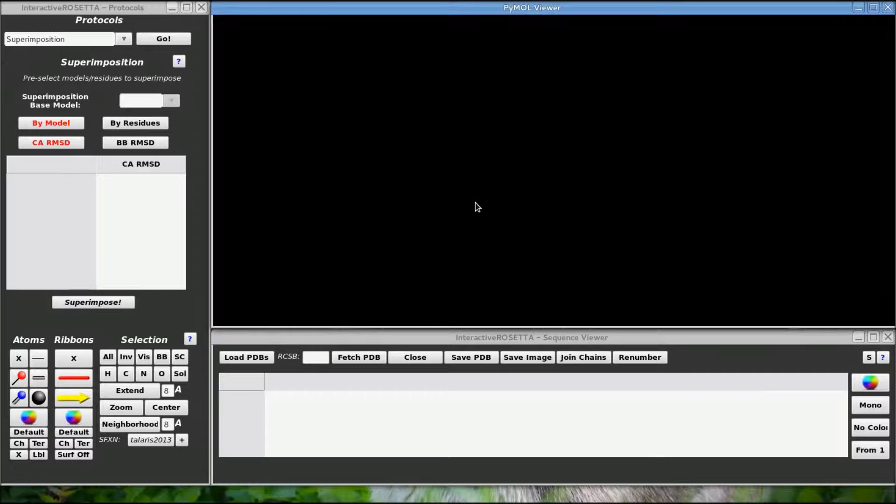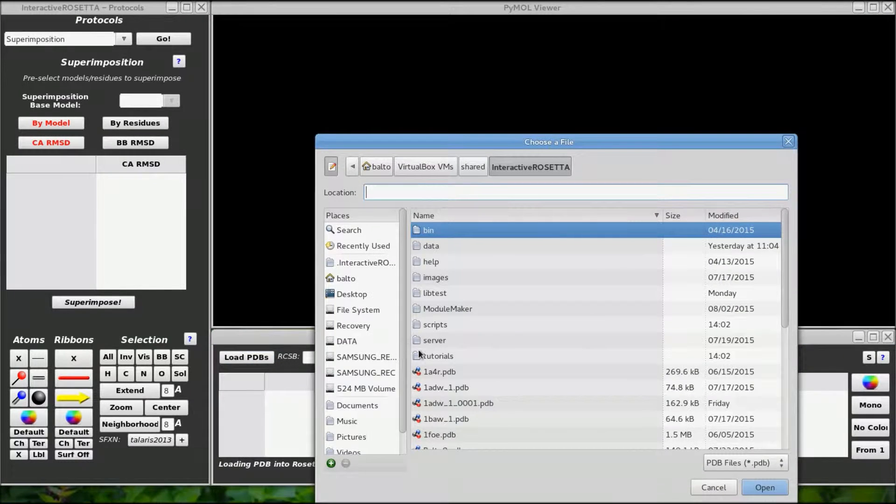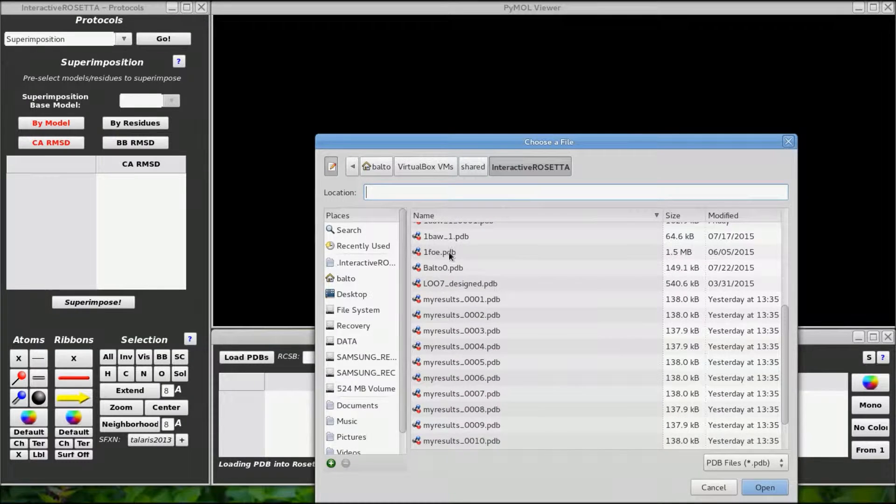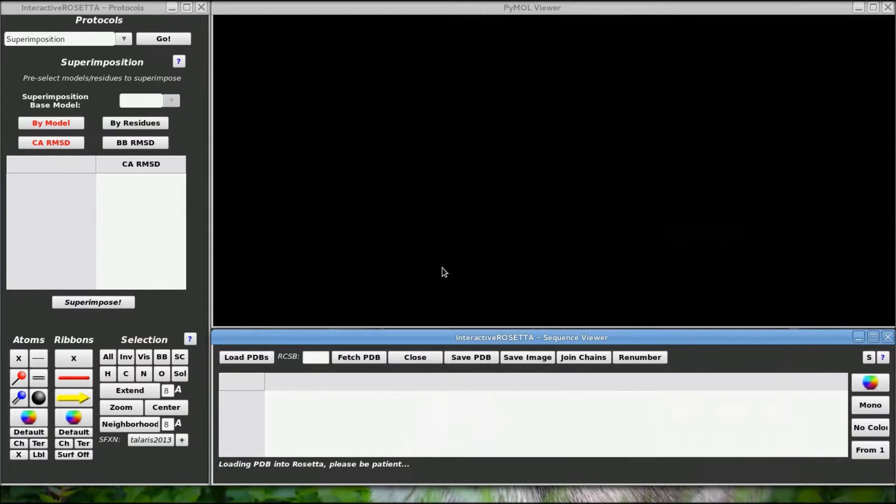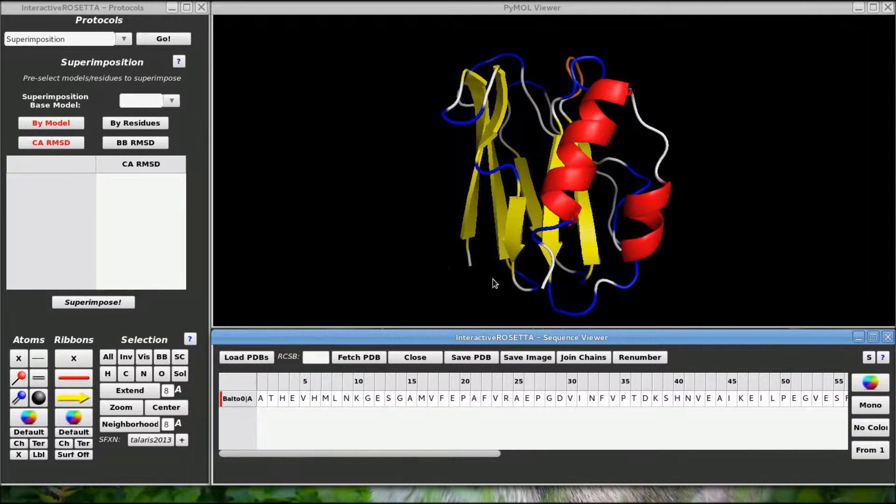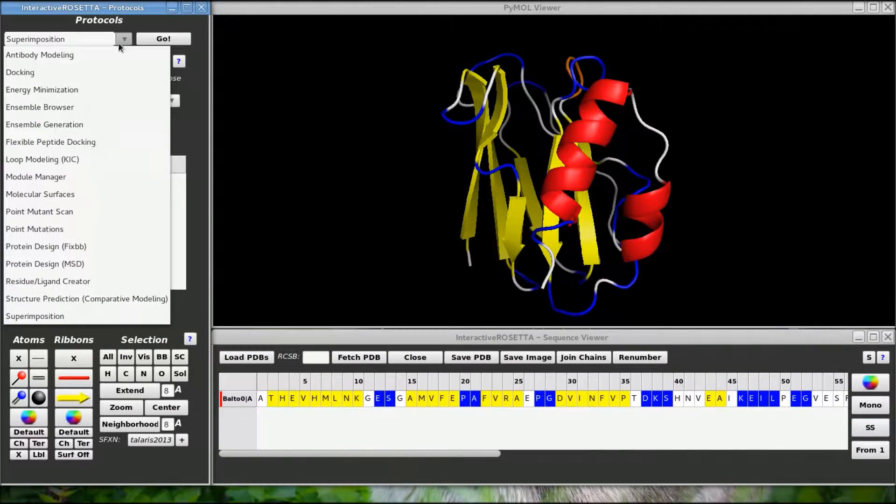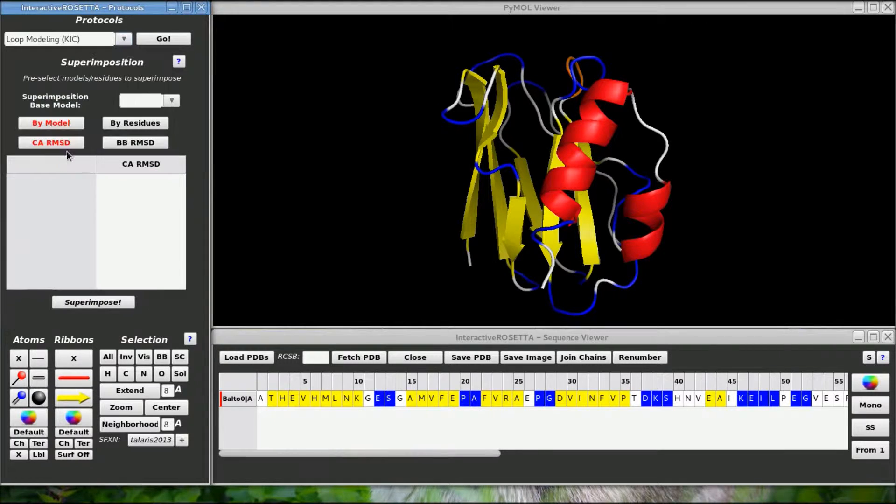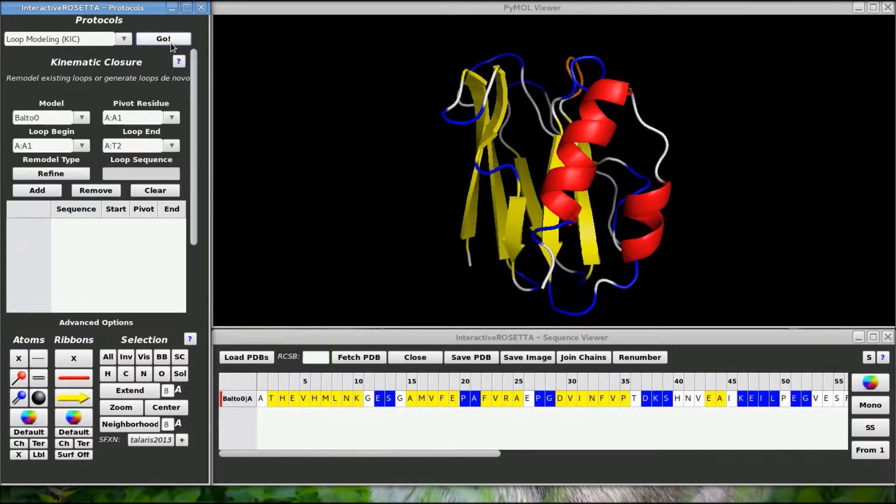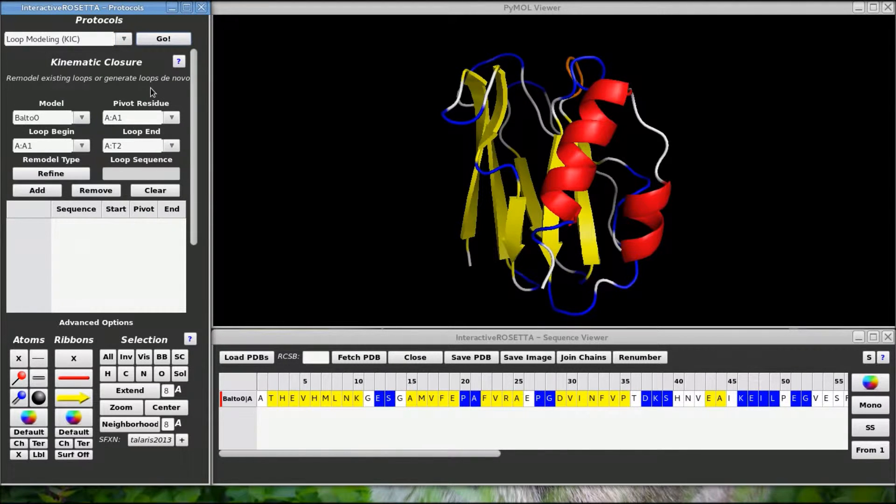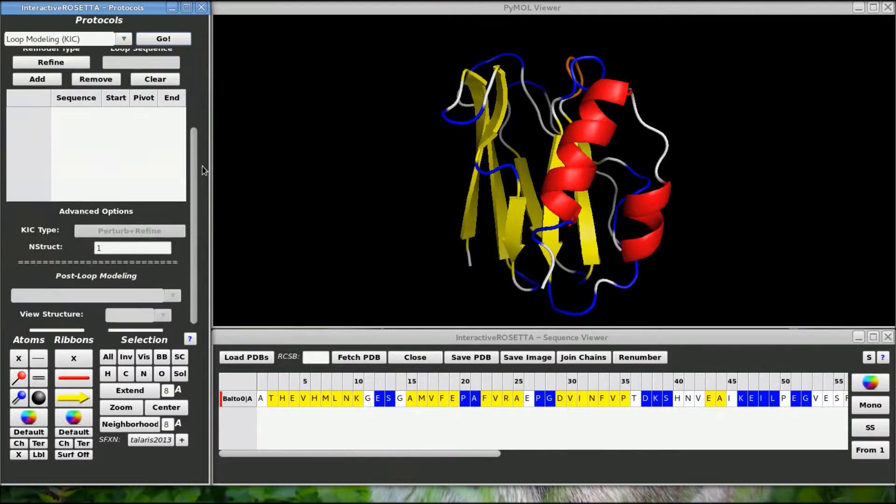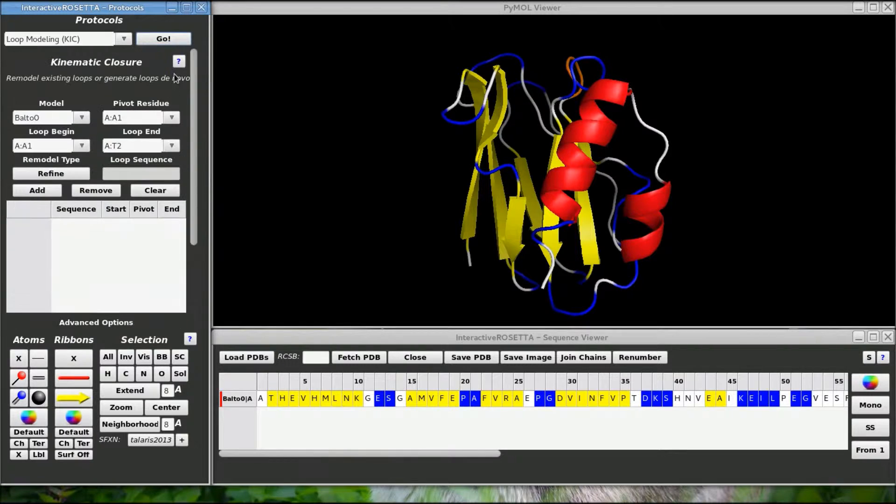I will be using the standard demonstration protein for this tutorial, so let me go and load a copy of it first. Now we can go over to the loop modeling KICK protocol in the menu and take a look at the controls. There are not too many controls, so it should not take too long to set up a KICK job.